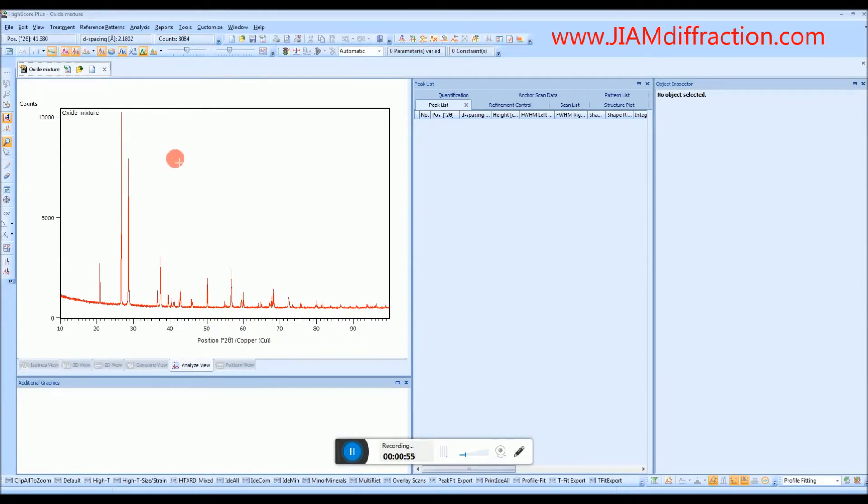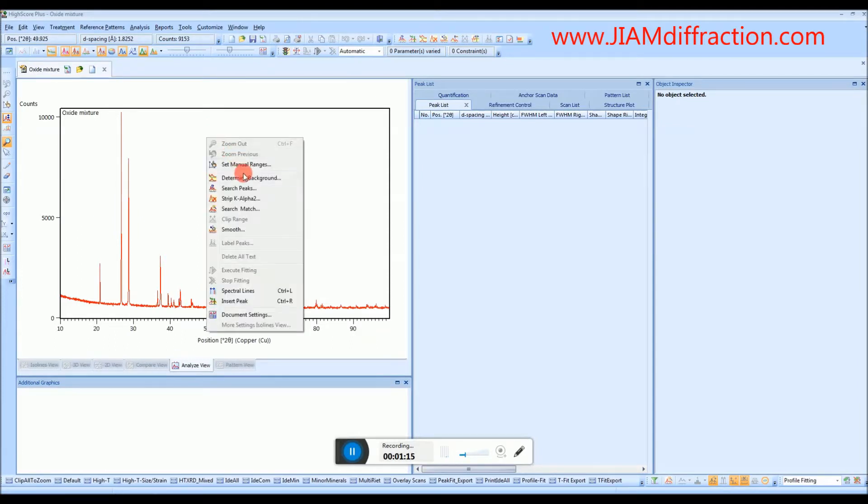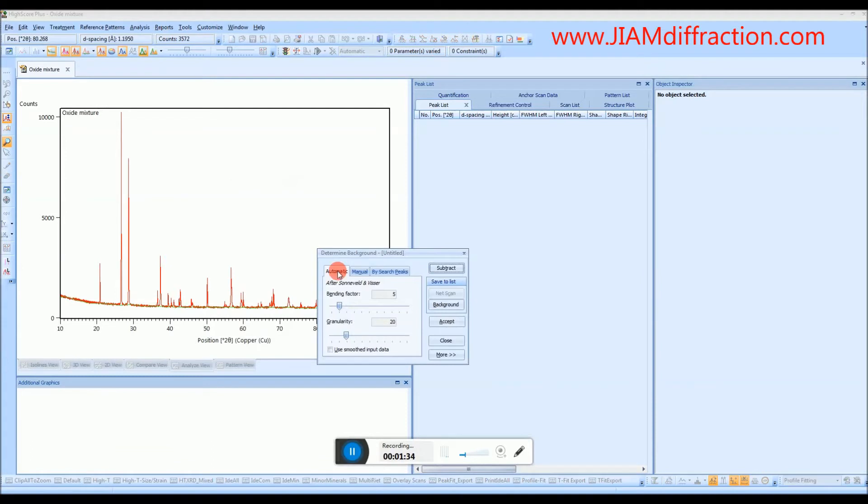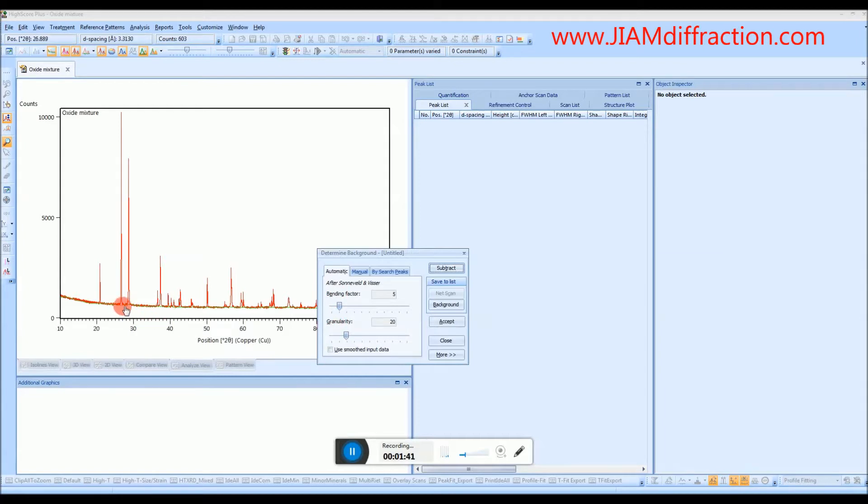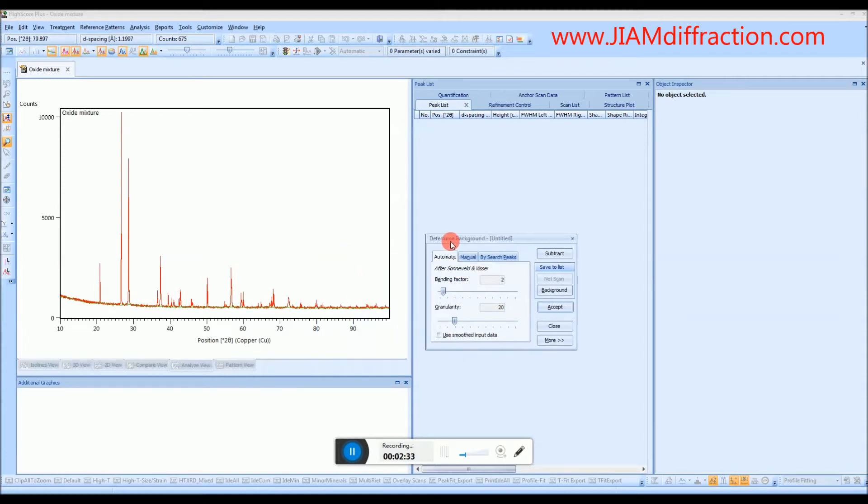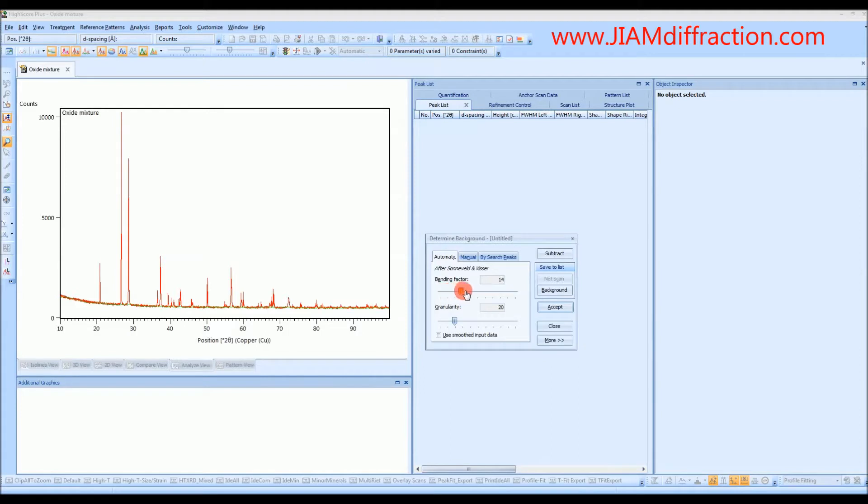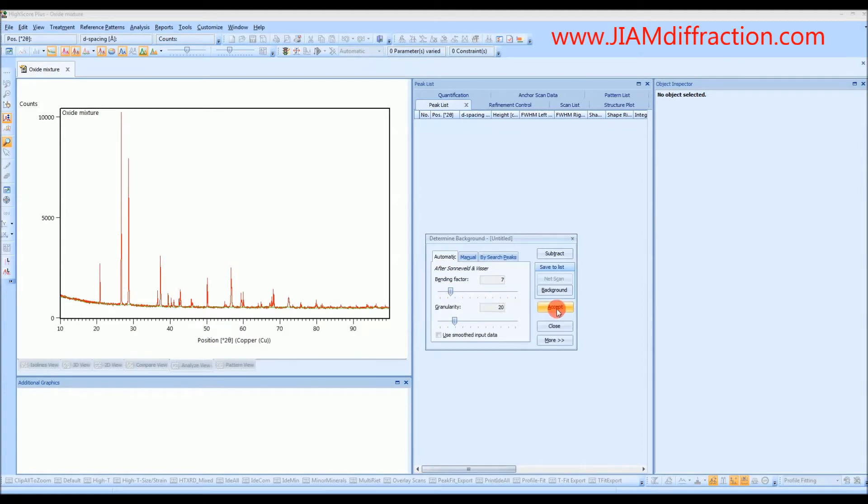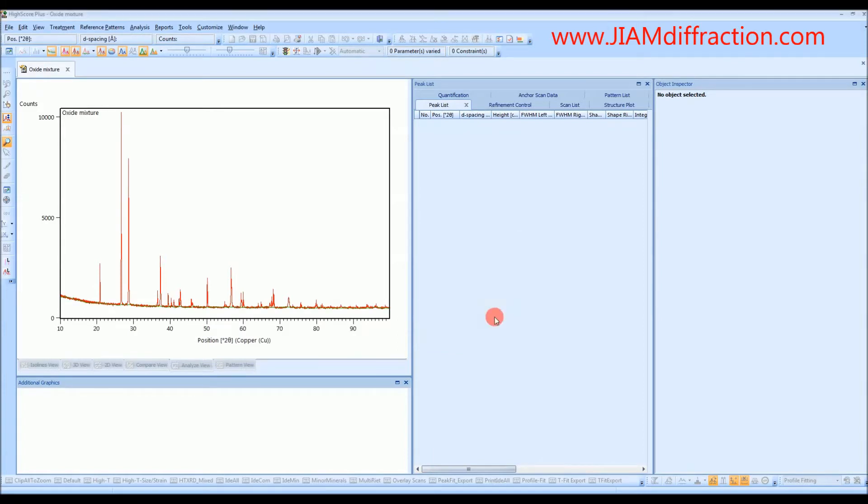Now the first thing we want to do is determine the background. In order to save clicks I just like to right-click, Determine Background. We see that we have two parameters here that we can change to try to improve our background. And here we see the background is represented as the green line. So typically I like to go around 20 for granularity and then play with bending factor to see what looks best. Now in this example the bending factors all look pretty similar so I'll just leave it somewhere around 7. But for now I will just accept the background as we have it. And we see that the background has changed to a dark green line.